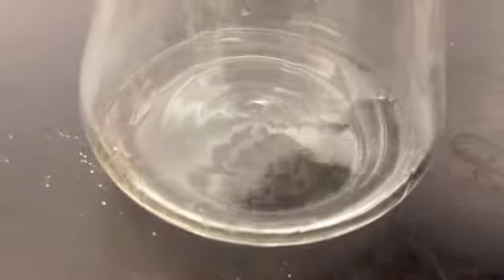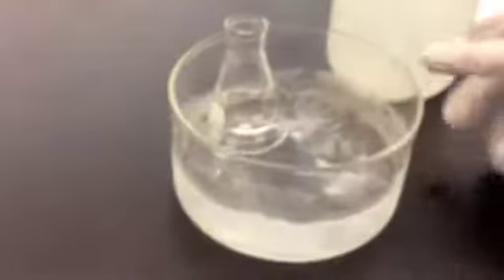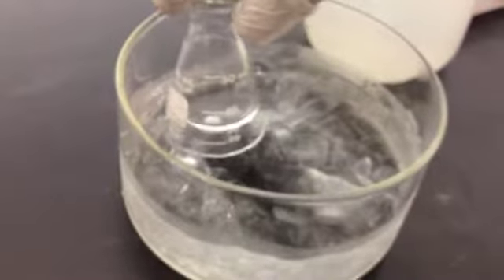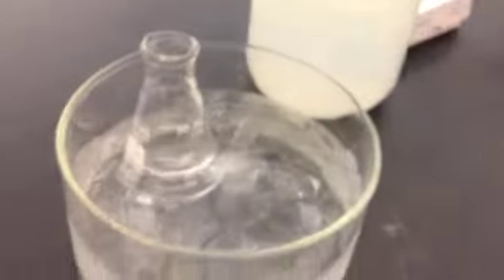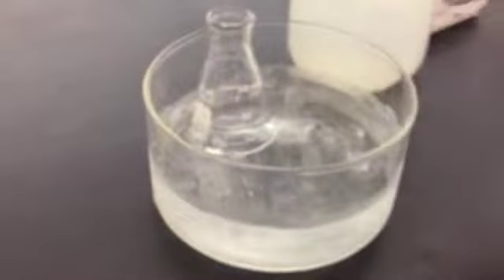As you can see, the ethanol is still boiling even though we took it off the hot plate. So let it cool to room temperature. What we have here on the side is an ice bath in a crystallizing dish, and I'm putting an Erlenmeyer flask of ethanol here in the ice bath to keep it cold. What we're going to do for recrystallization is actually we're going to precipitate out the benzoic acid from here and then vacuum filter it through here.